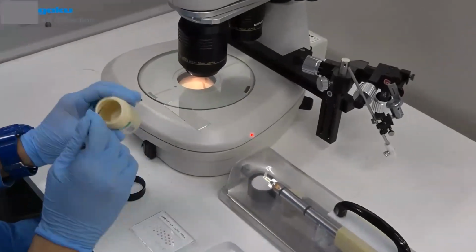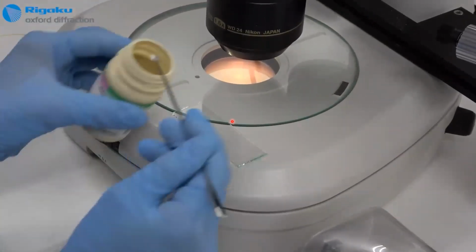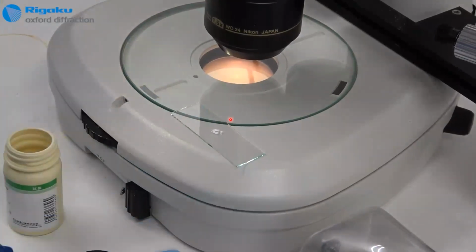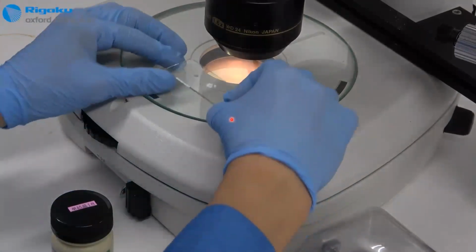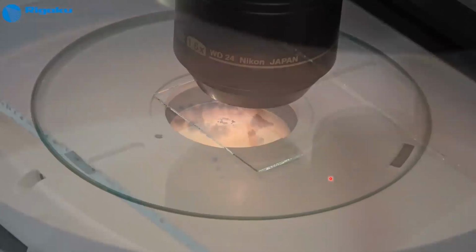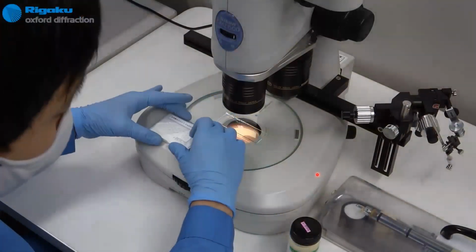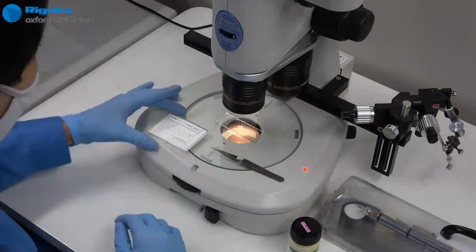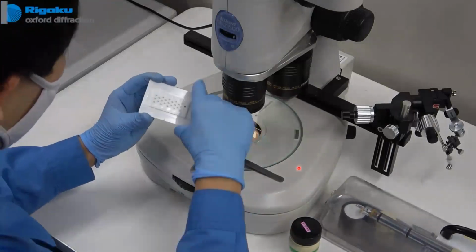So our colleague Ito-san from the Tokyo Applications Laboratory is just taking a minute bit of powder that you would otherwise use, for example, in a powder X-ray machine. This powder is a test sample which is already nicely microcrystalline. Otherwise, at this stage, you could grind it a bit further with, for example, another glass slide on top or in a mortar, different ways. And then the next thing that you need to do is to apply this powder to a TEM grid.